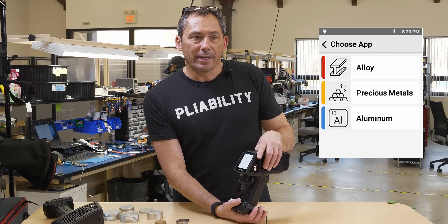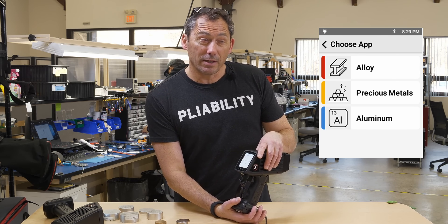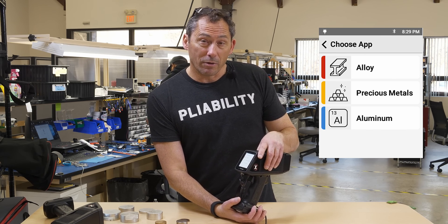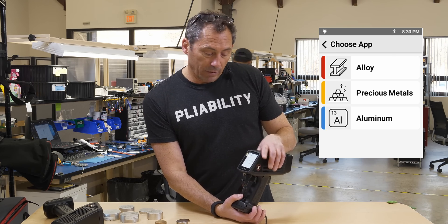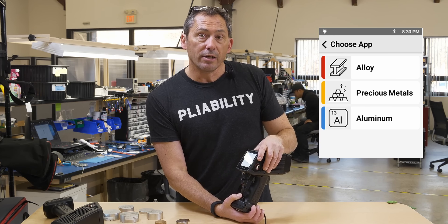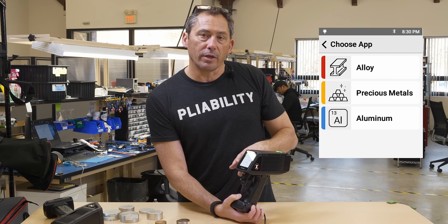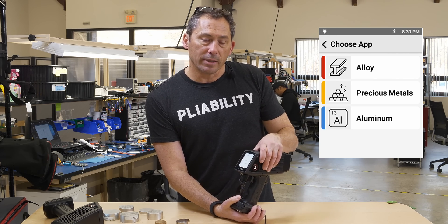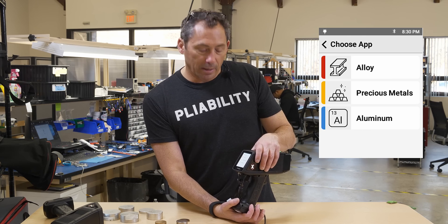Rhodium right now is about $13,000 an ounce. Palladium is about $1,700 an ounce, and Platinum is about $750 per ounce. So those Car Cats are really valuable. With the Car Cats app, if you're doing car catalyst recycling, when you crack them open and pull out that honeycomb powder, you can test for the amount of rhodium, palladium, and platinum to understand how much it might be worth.